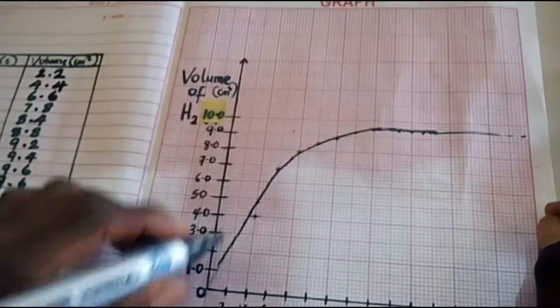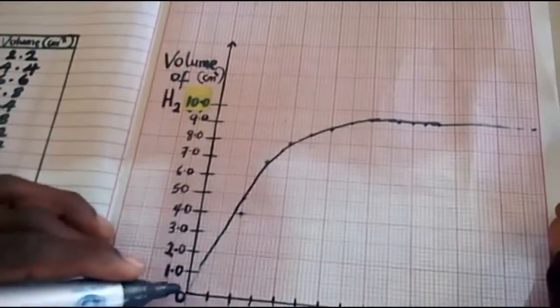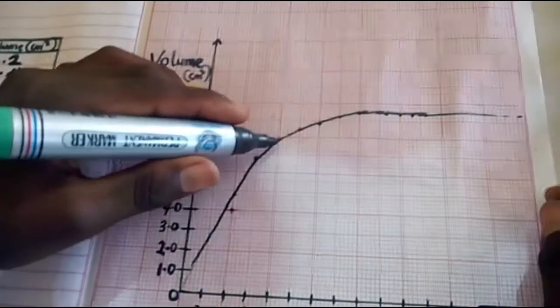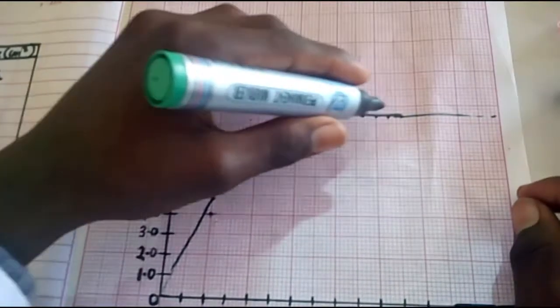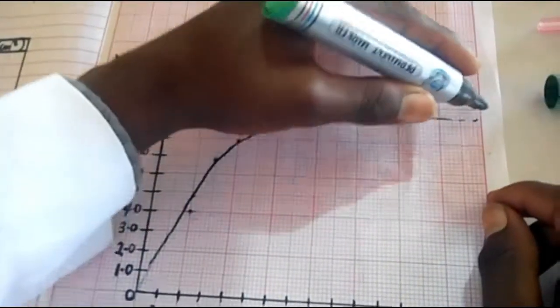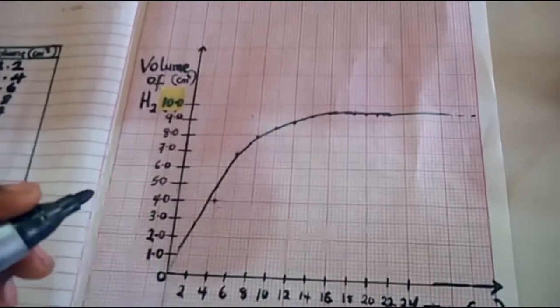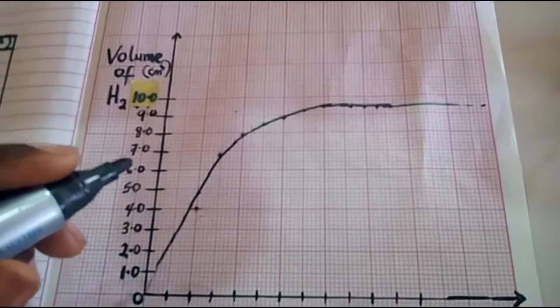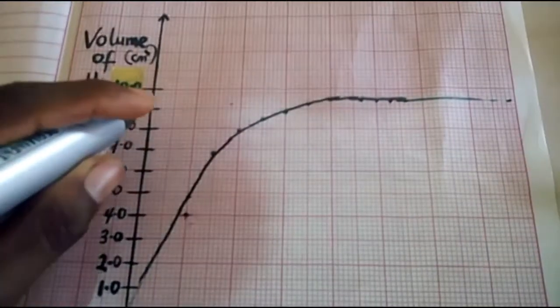The rate is not uniform over the whole reaction. The reaction rate is highest at the start and decreases gradually with time, becoming 0 when the reaction is completely used up. From our graph, the total volume of hydrogen gas produced is 9.6 centimeter cube.